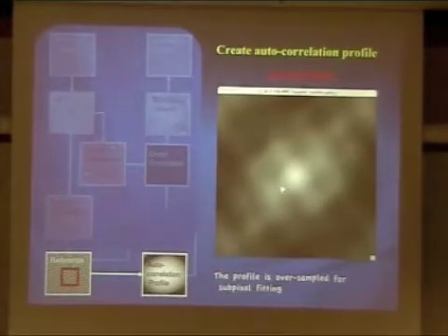This is the middle of it, and it will repeat somewhat in the next unit cell, and the next and next, but the peaks become weaker and weaker. The autocorrelation will end up with a peak in the middle and then levels down on the side. So in the process, we take just the middle part as our profile for searching.